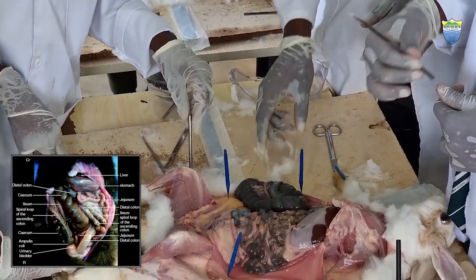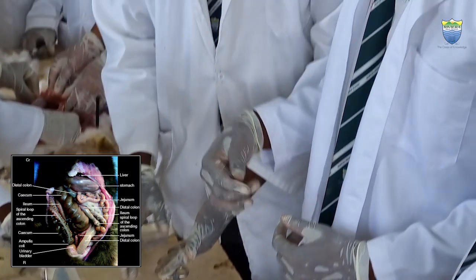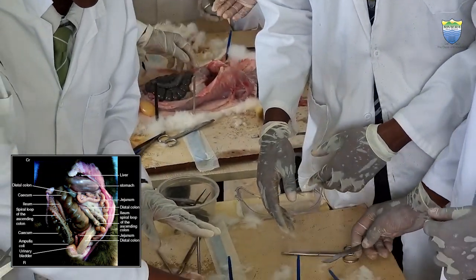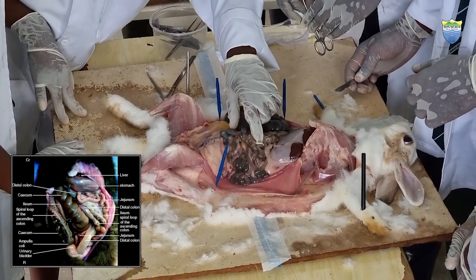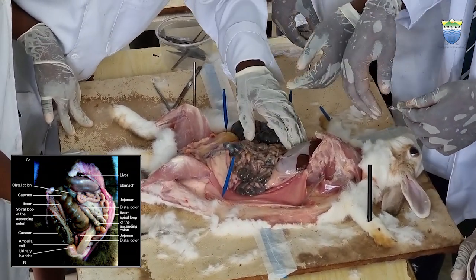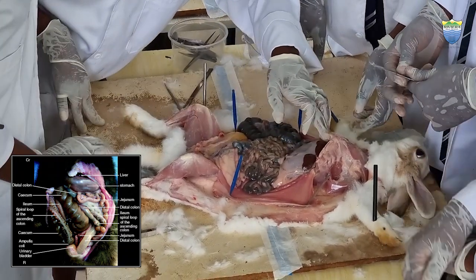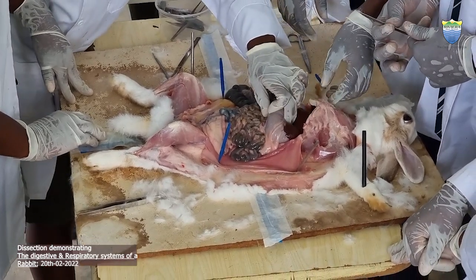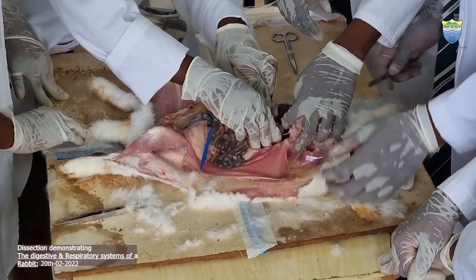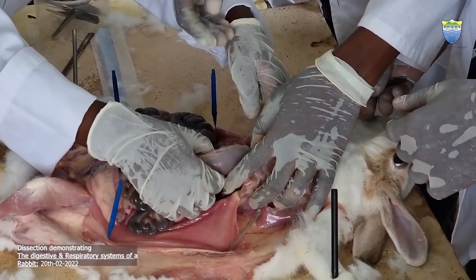That's where most of the food is processed, where the end products, like the fecal materials, are formed. And if we dig deeper, before these ones we have the stomach. This is the stomach. This is the liver. Then the pancreas.